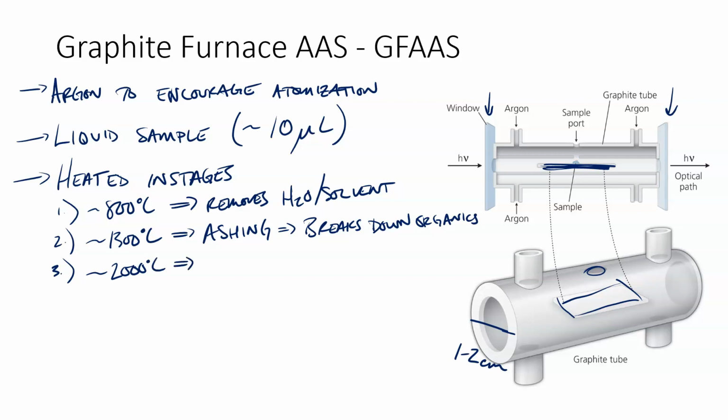And by heating this pretty quickly, what actually happens is that as that surface, that graphite platform, heats up quickly, we'll actually get this little plume, almost like this little explosion of material. Right? Plume of gas phase. So think about it almost like a little volcano, right? Eventually we get to some point where that material just goes into the gas phase, and as it expands from solid to gas, it creates this little explosion, this little plume of material, and that's when we analyze.